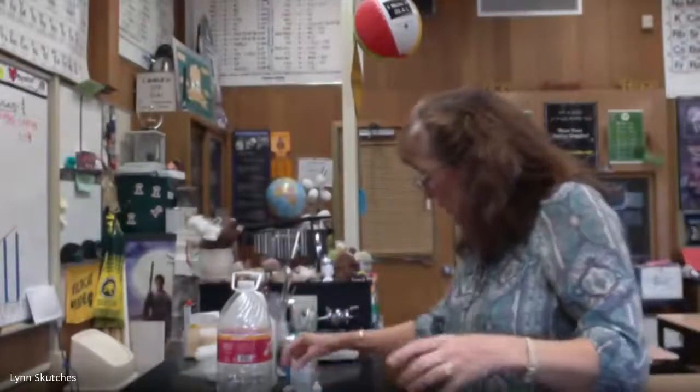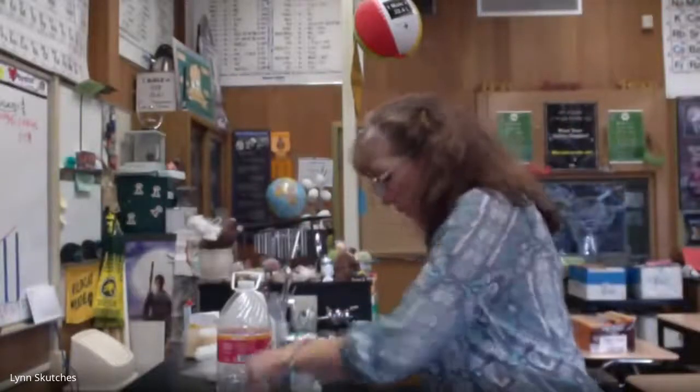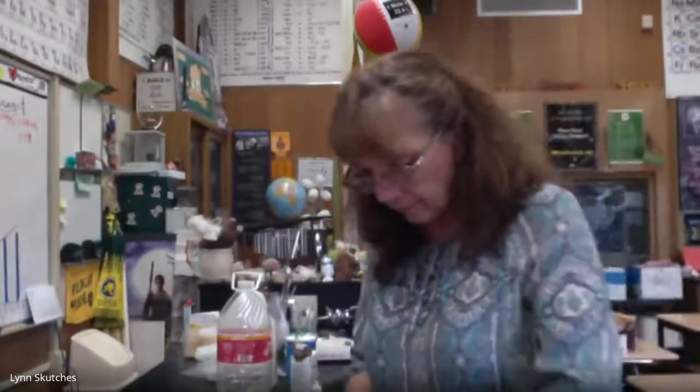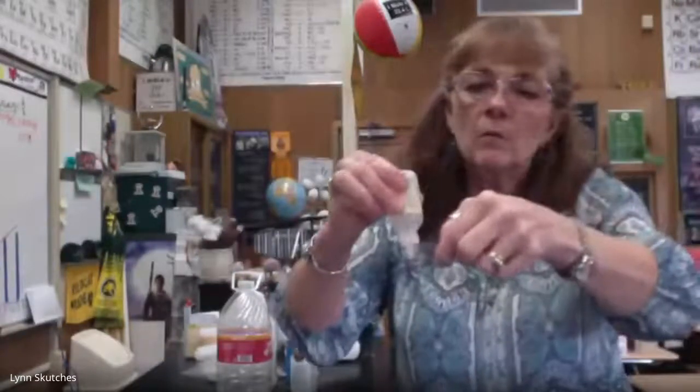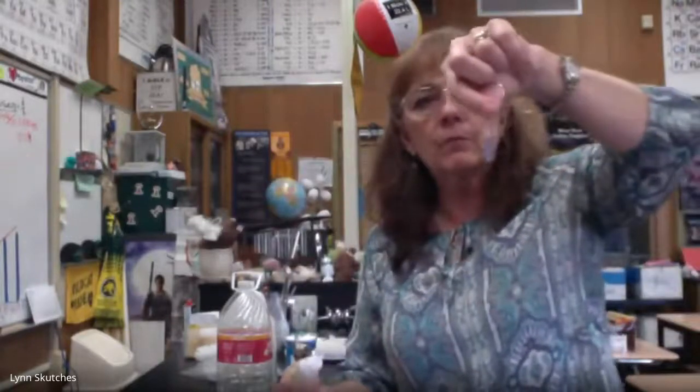So another type of indicator you may be familiar with are litmus papers, and litmus paper has paper that's been soaked in plant pigments, and it comes in, they call it red and blue. They don't look red and blue, they look pink and purple, but that's okay. That's my eyeballs, I guess. If I put acid on the blue paper, it will turn it red or pink. And if I put base on the pink paper, it turns it blue.